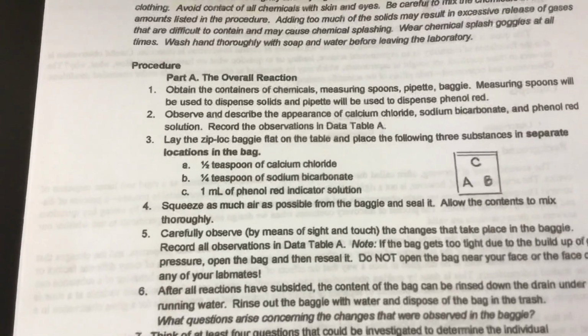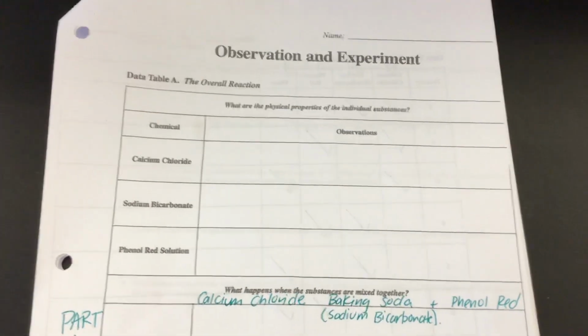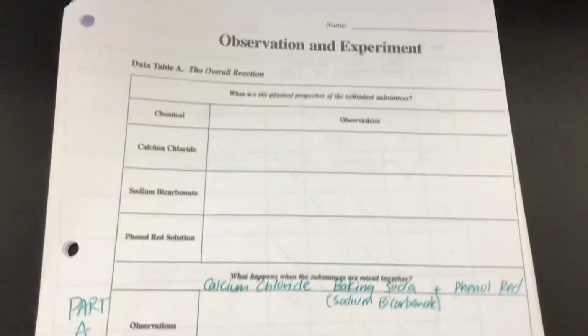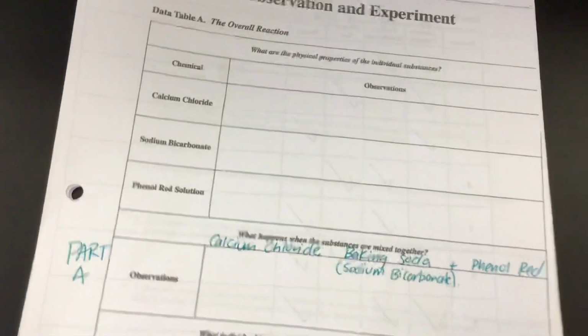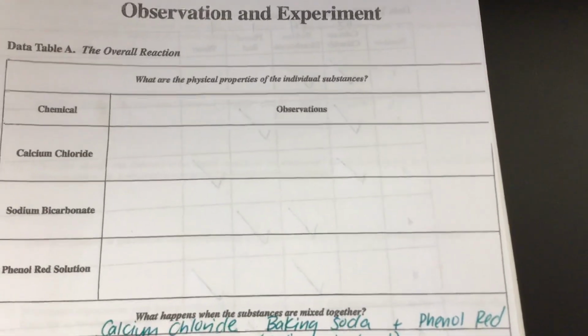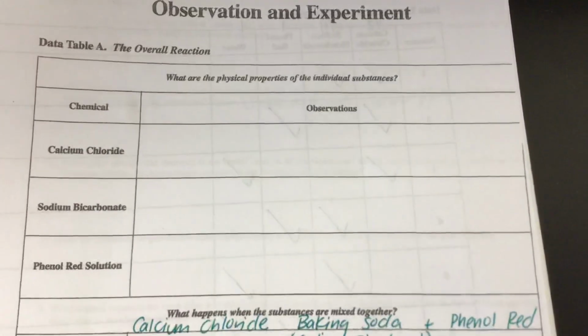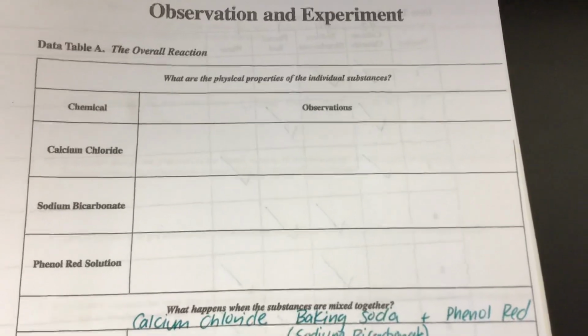Now before we get to the overall reaction, we need to do a little bit of recon, and we need to describe what the chemicals look like. So please go to slide number 3. It says observation and experiment, data table A. I'm going to show you what the different chemicals look like. We're going to start with calcium chloride. In the space provided under observations, please describe what the chemical looks like to you. You can say what color it is, the shape.